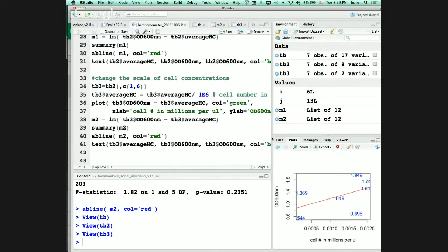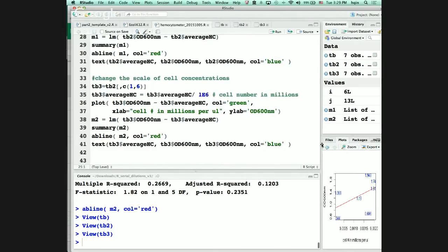So because this is basically application of this. In the exam or homework, I don't require you to actually write this, but you should be able to know how to run it and get the result.